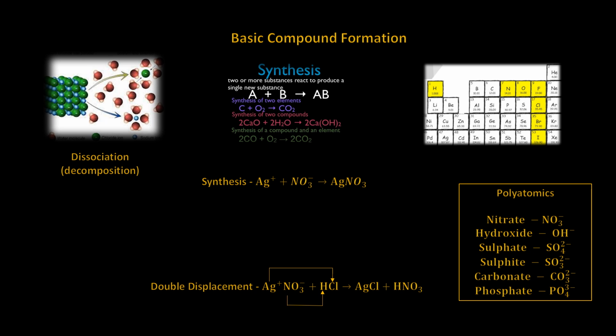These will dissociate and recombine with a hydrochloric acid, which is dissociated in the liquid water to form silver chloride and nitric acid. The nitrate molecule has a -1 charge, or the total ionic charge of -1. The silver atom also has a +1 charge. The charges are shown in the reaction equation. This is a double displacement reaction.